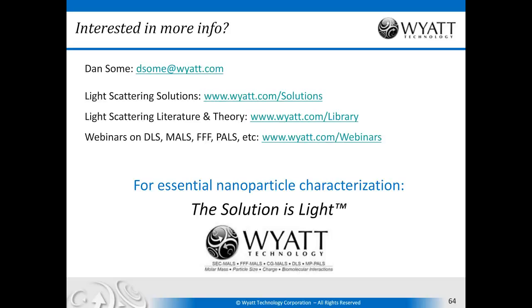Next one is, how can I monitor particle aggregation over time? It depends on what causes the aggregation. Certainly a very simple way to do the measurement is to put your sample into the dynamic light scattering cuvette. If the aggregation is rapid, you would just leave it there and look at the change over time.